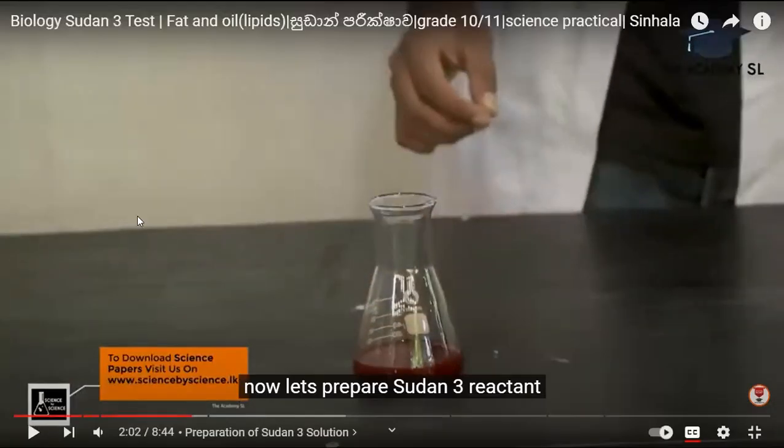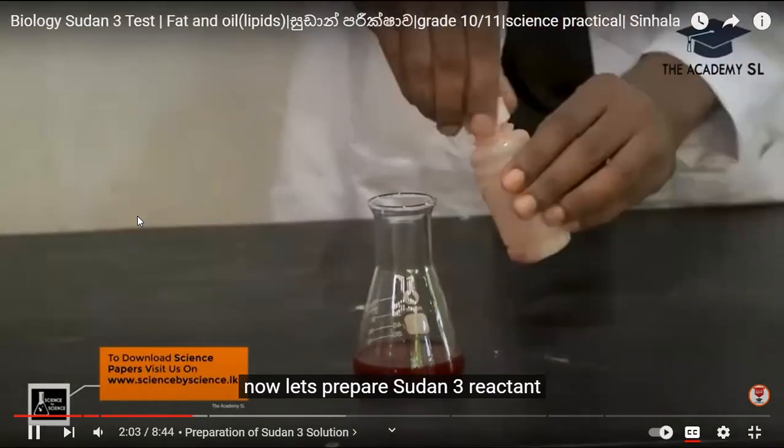So this is how we prepare the, what is it? Sudan 3 solution. We are dissolving Sudan 3 powder in ethanol, ethyl alcohol.